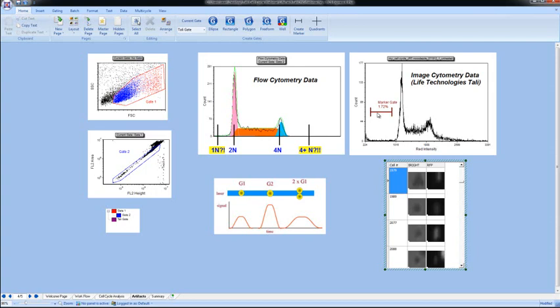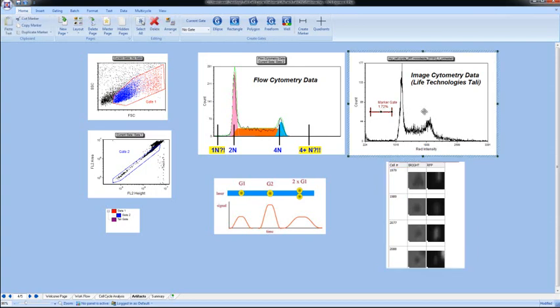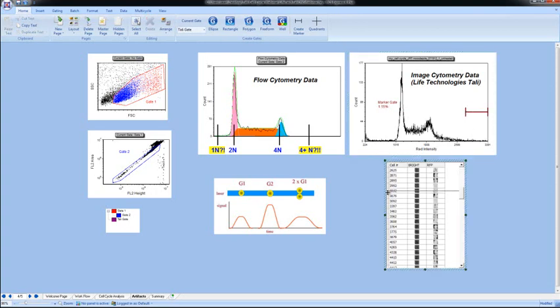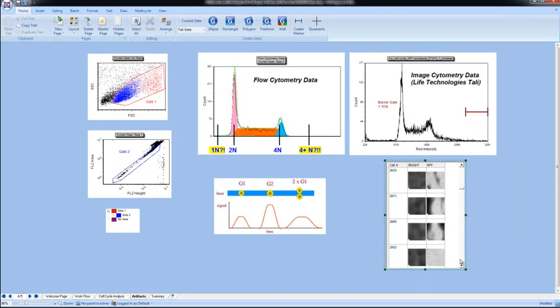Now, another thing that can happen when you're imaging data is that cells can be overexposed. So you actually take an image of a cell, it's too bright to be properly measured, and this will happen typically on the very high range of our analysis. So if we select these cells that are way out here, you notice in our cell gallery that these cells are in fact greatly overexposed. Most of the segmentation area is pixels that are going to be around 255 in value. So these pixel values are way too high to be dealing with, and we should exclude them from our analysis.